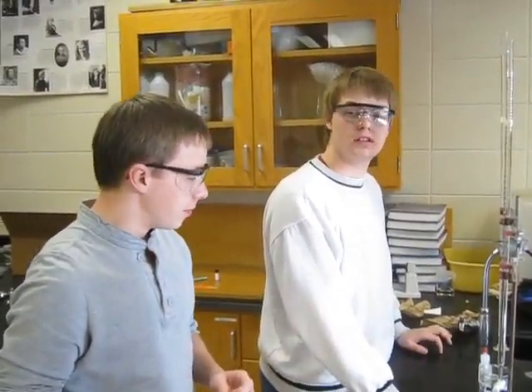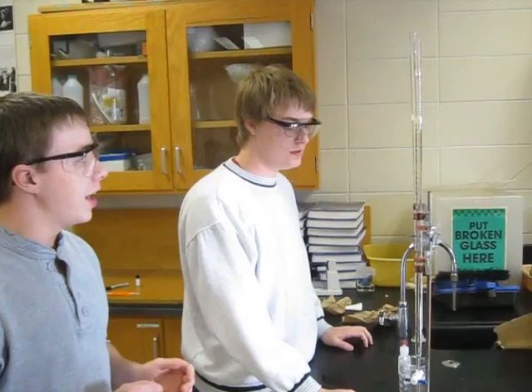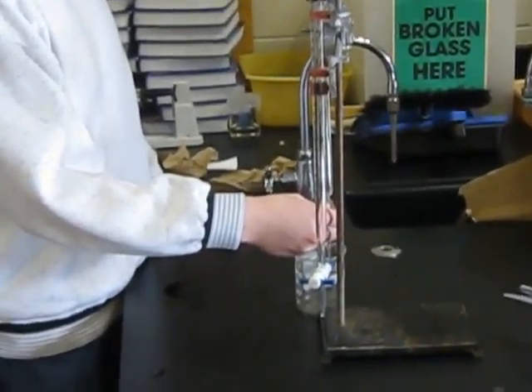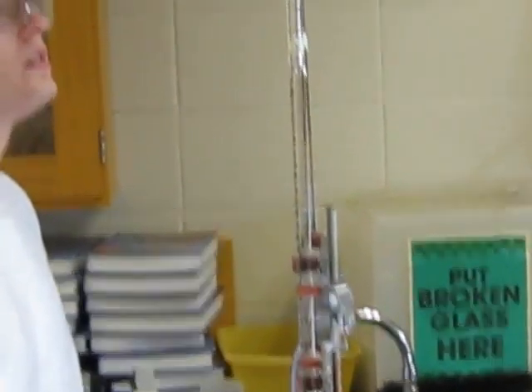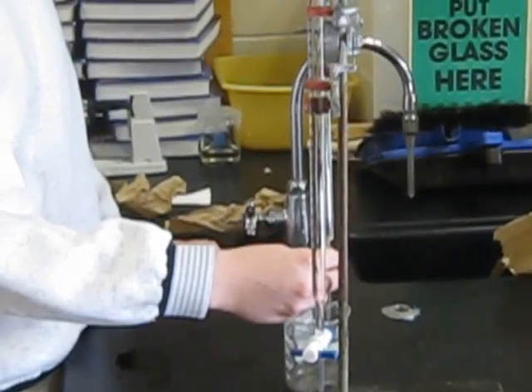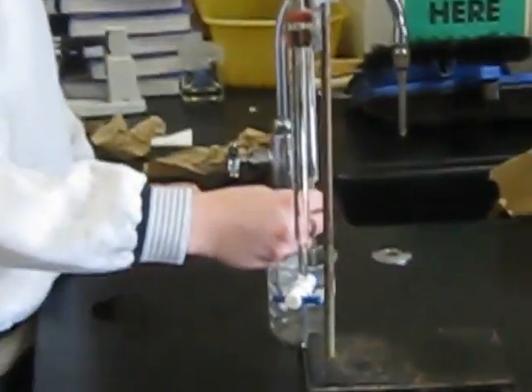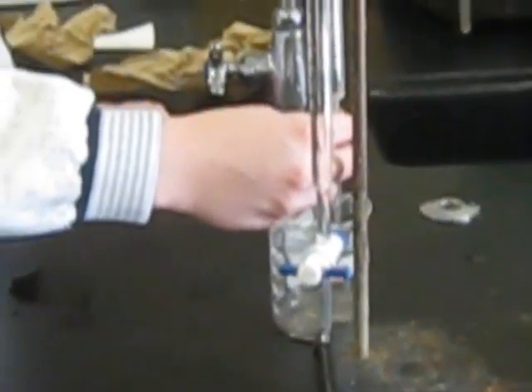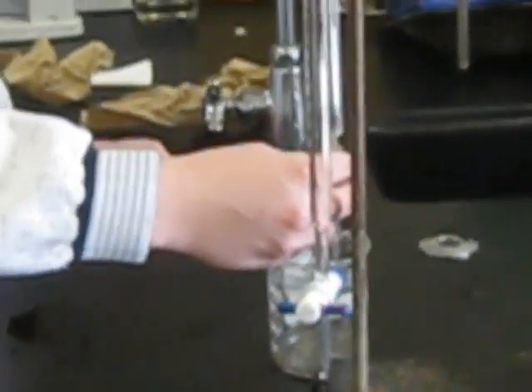So now we're going to actually go ahead and do the procedure. My partner here is going to begin adding 10 milliliters of acid into the beaker. 15.4. Okay. We want to make sure, be very careful, that we only add 10. And we want to make sure that we write down exactly how much we add in.